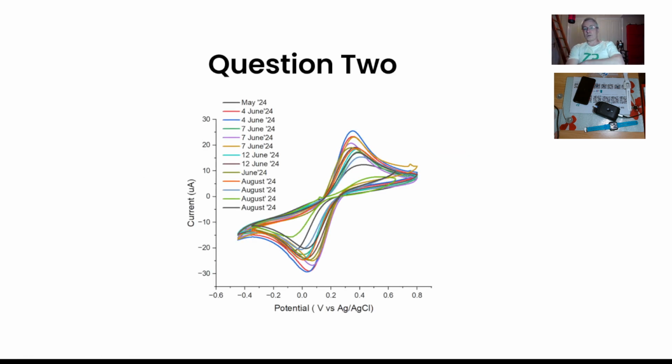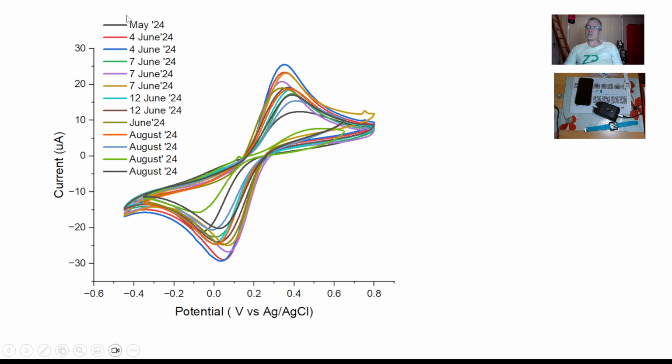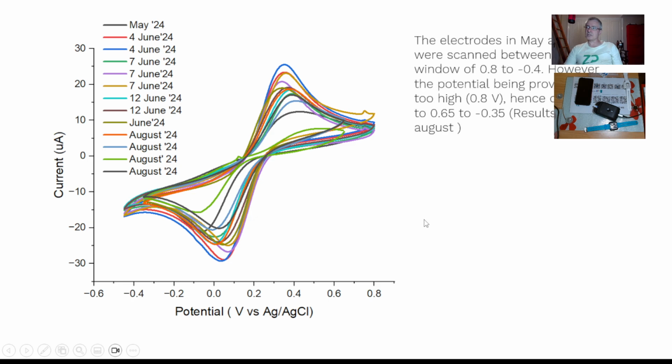Question number 2. This one gave me some concerns because first of all, I got an email to say I'm not getting reproducibility on your gold electrodes. Hey, this is Zimmer and Peacock. We do support our technology, like I am now, saying, okay, send me some slides. When I did dig into it a little bit, I found all these dates and times.